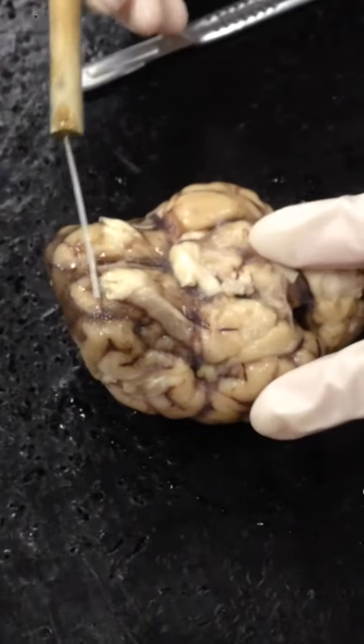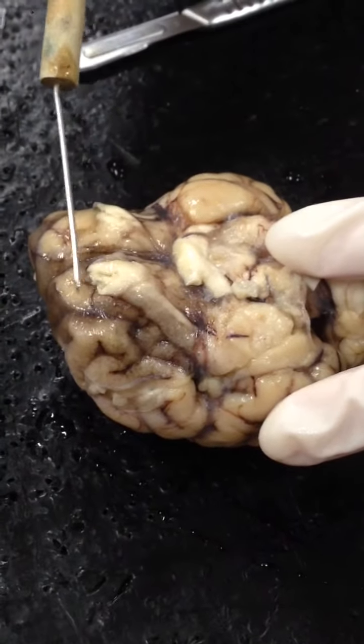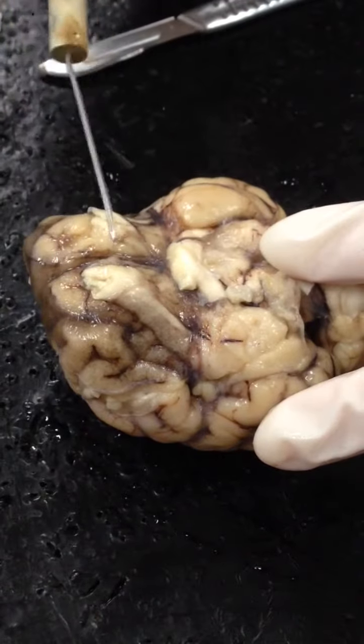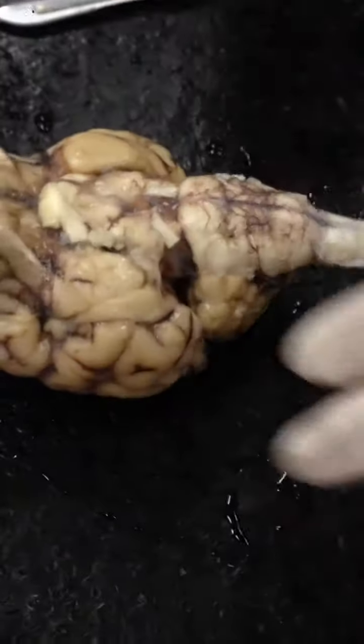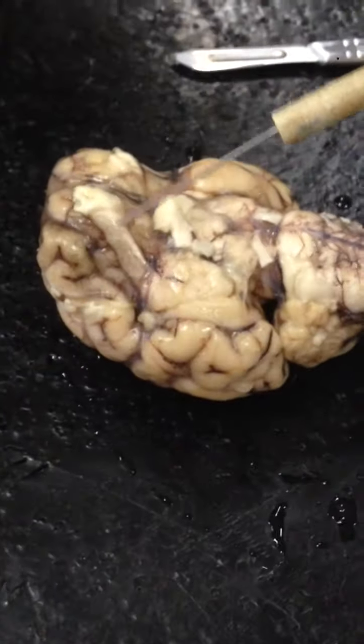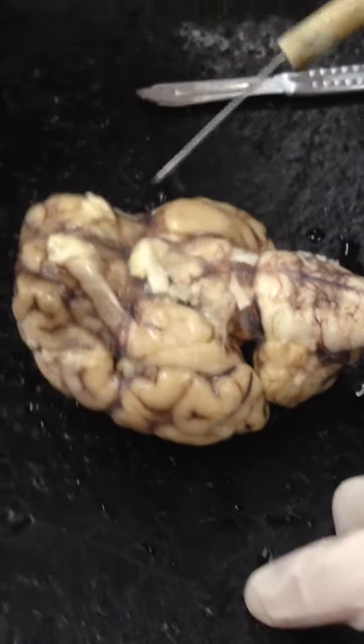If we turn it over, this is part of an olfactory bulb, okay? Usually it comes all the way up and it's a flappy portion, just so you guys know, but it's been cut off. So this would be where the olfactory bulb would be. The tract is this line here, the tract going up, that's your olfactory tract, okay?